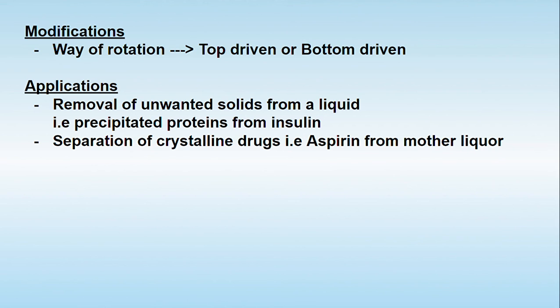So my friends, keep in mind that the filtration centrifuge works on both principles, and the name of this particular centrifuge is the perforated bowl centrifuge.